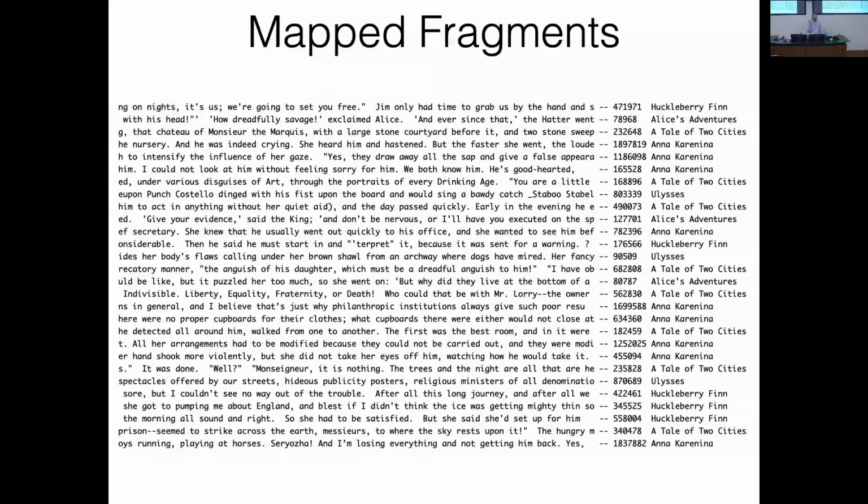Okay, so the next thing that we want to do is quantify this and say, okay, how many lines, how many of these reads do we have from each of the books, right? Because that was one of our goals, to get a feel for how much of each book there was in the library. And that's pretty easy, because one way we could do it is just go through and keep a table of Huckleberry Finn and say, okay, there's one.